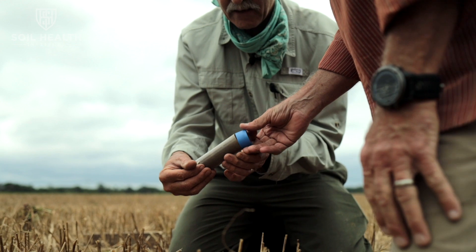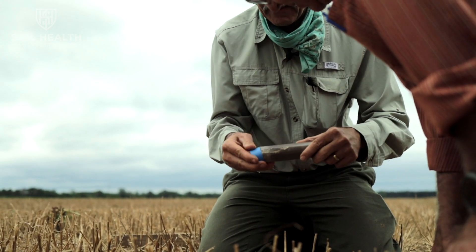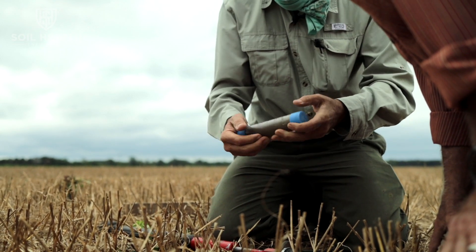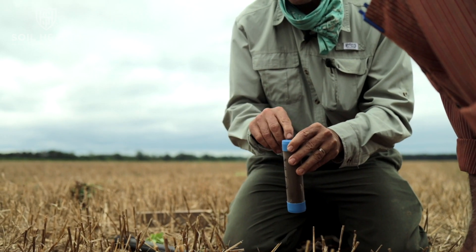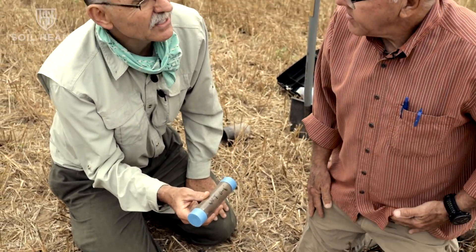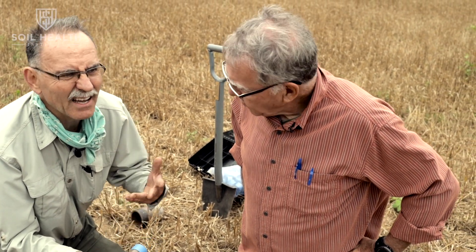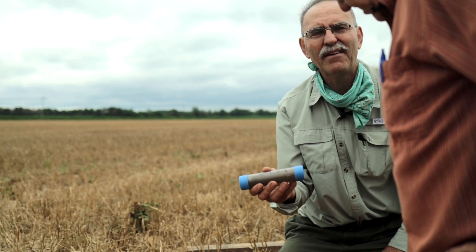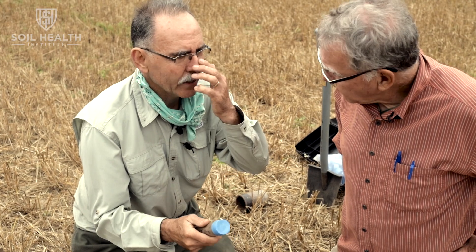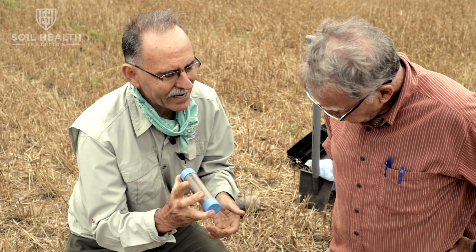You're going to cap it on this side and cap it on this side. So this is labeled WT 0 to 6. There are little holes to allow some air out, but I'm going to take this home to the lab. I'm going to dry it at 105 degrees Celsius — that's about 220 degrees Fahrenheit — for 24 hours to get rid of all the moisture. We then have a known volume and a known mass, and we can calculate moisture and actual dry weight from this.